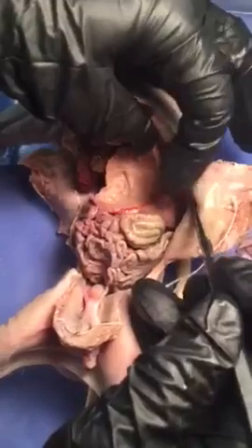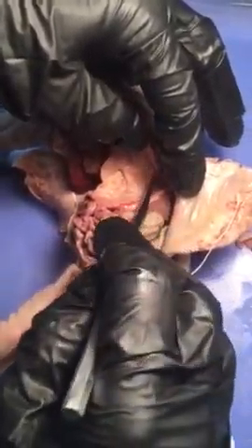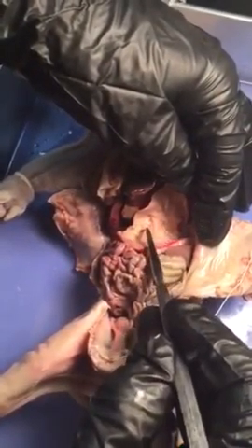Yeah. Okay, now I want you to take a look inside the stomach. And those are the folds on the stomach, right? Okay, see how this... I'm trying to get a good view here. All right. So you see this.